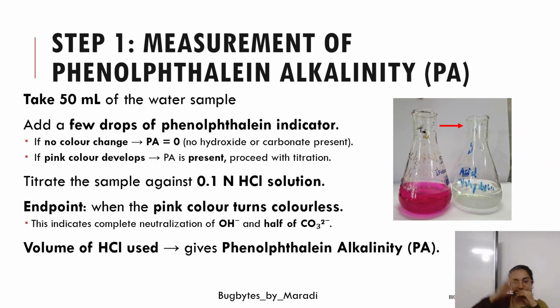So what kind of acid-base titration? We will have the water sample, which we already know is somewhat basic in nature, and the acid we are going to use is 0.1 normal HCl or sulfuric acid. Here the endpoint should be from the pink color to colorless.